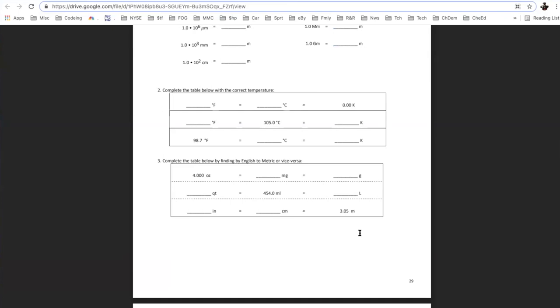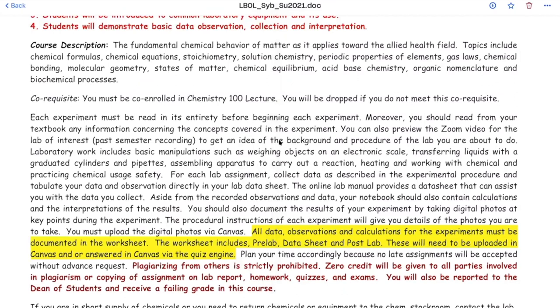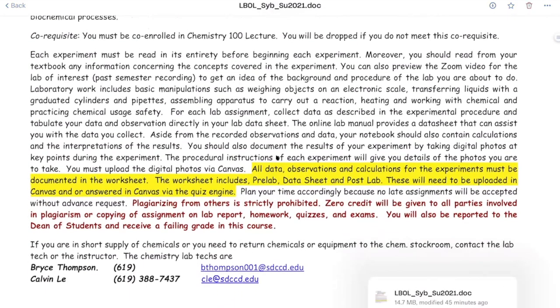There's going to be a pre-lab, kind of get you prepared for what the experiment's about, kind of like prime you in terms of what calculations you're going to do. There's the data and observations where you're actually collecting the data and you're writing down your observations when you're doing the experiment. And then there's the post-lab in terms of calculating the results or drawing conclusions as to what that experiment was about. Those are the three components. Okay, so hopefully I will talk more about that when we get into that part of the discussion today. So that's what this is about.